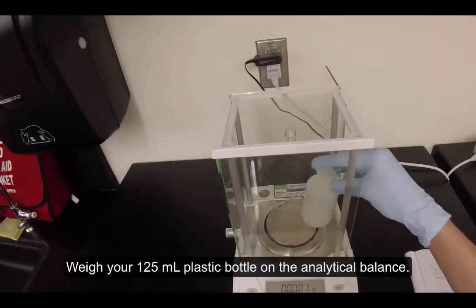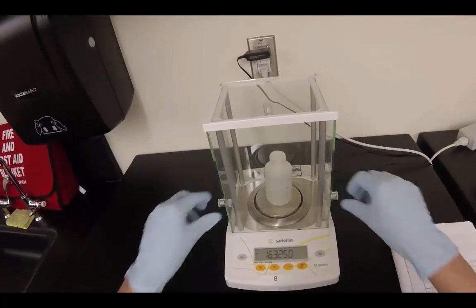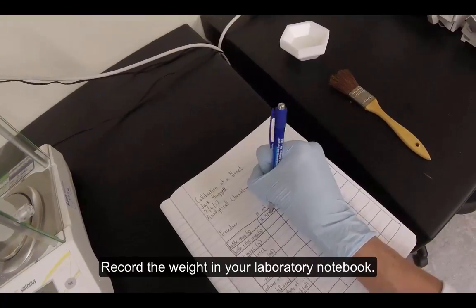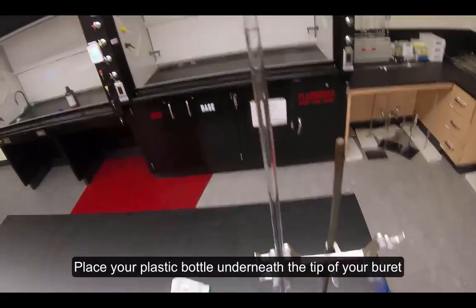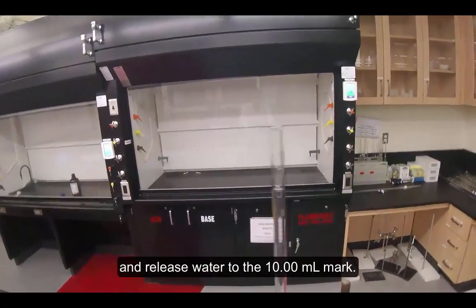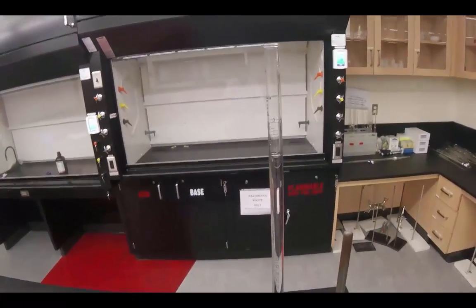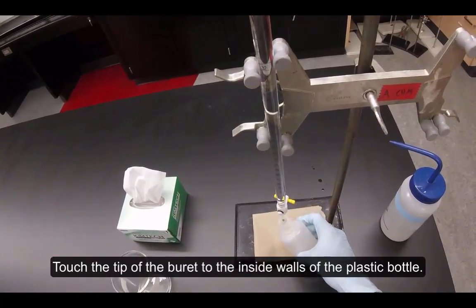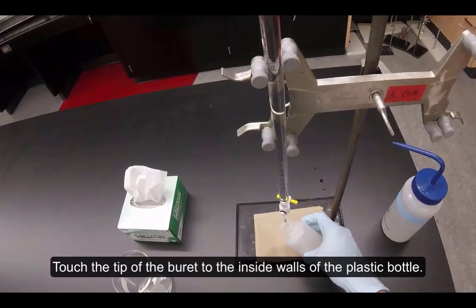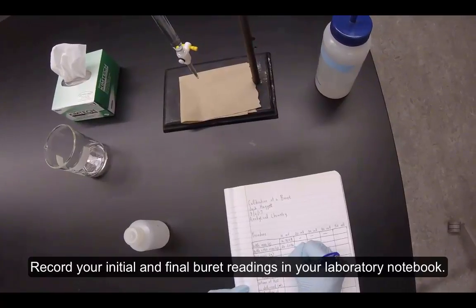Weigh your 125-milliliter plastic bottle on the analytical balance and record the weight in your laboratory notebook. Place your plastic bottle underneath the tip of your burette and release water to the 10.00-milliliter mark. Touch the tip of the burette to the inside walls of the plastic bottle. Record your initial and final burette readings in your laboratory notebook.